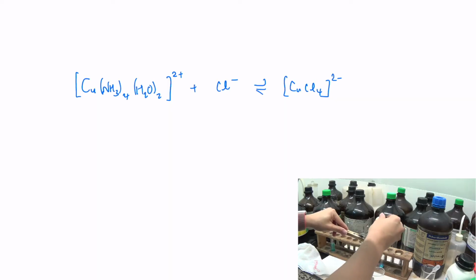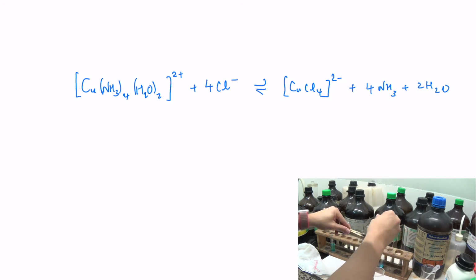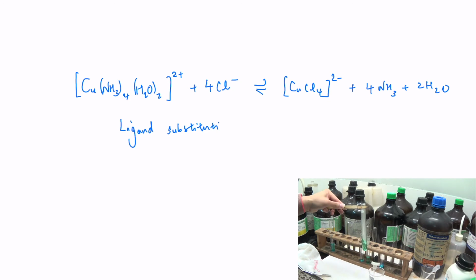I think I probably had too much of it in there. That is not going to go anywhere at all. Okay, so slowly you could see that the solution has gone, the deep blue solution has gone green.